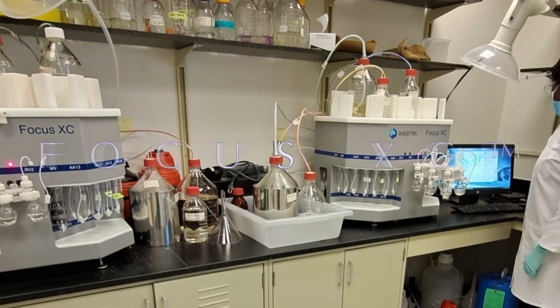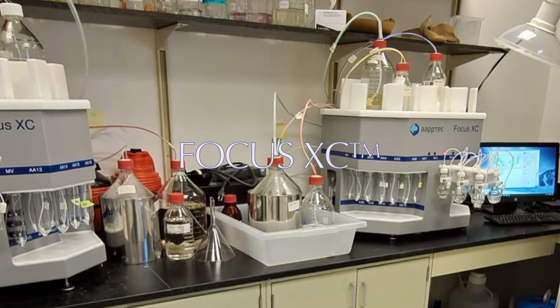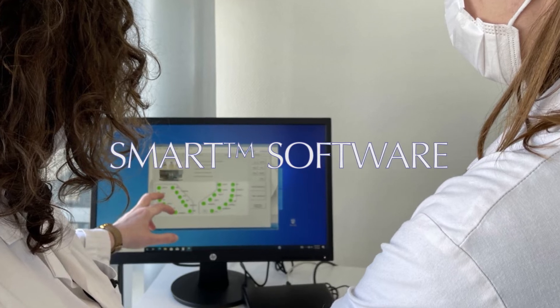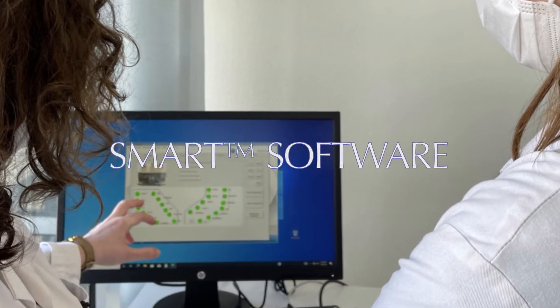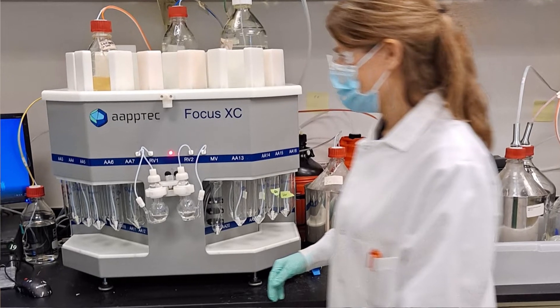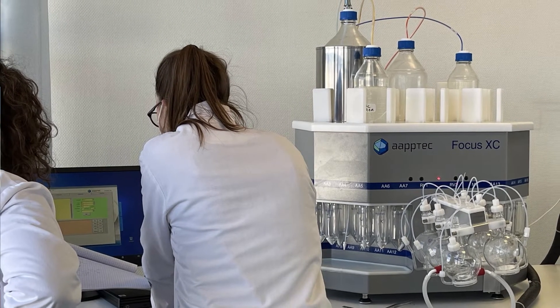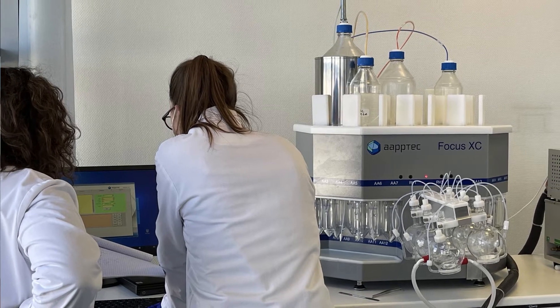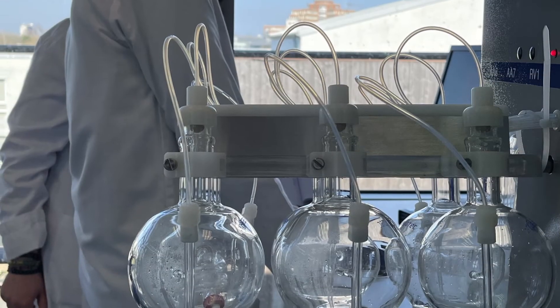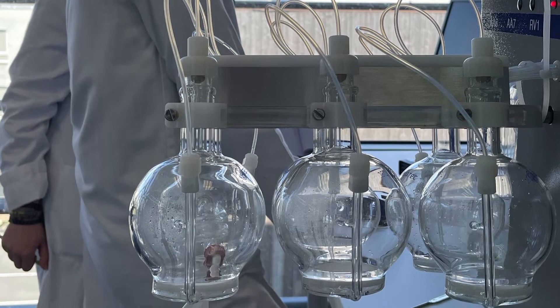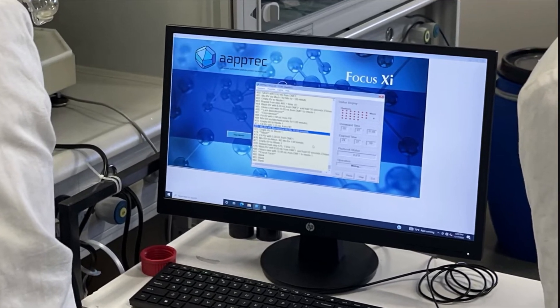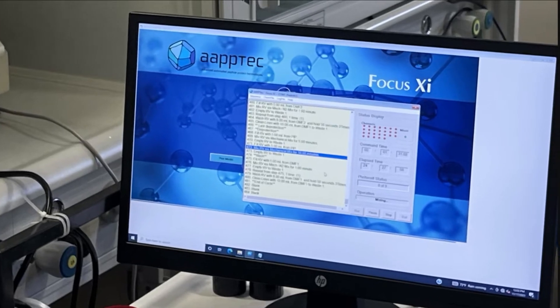Our best-selling peptide instrument, the FOCUS XC line of fully-automated peptide synthesizers, provides parallel peptide synthesis and comes with smart software that predicts synthesis difficulty and provides the best protocol. The FOCUS XC is capable of simultaneous and parallel peptide synthesis, utilizing 1–6 reactors, 24 amino acid vials, 6 solvent reagent lines or optionally more, a scale range of 0.01 to 5 mmol per reactor, and versatile user-friendly software, giving the FOCUS XC unique abilities and providing novice and expert chemists with virtually unlimited synthesis options.